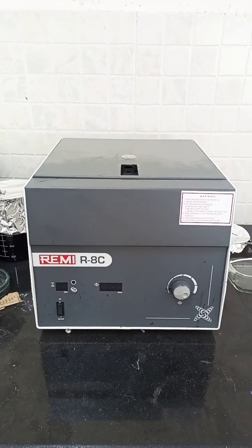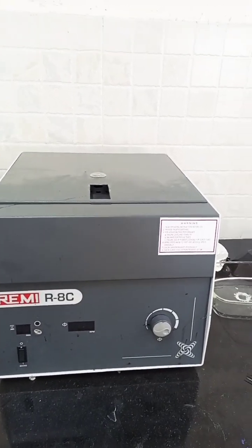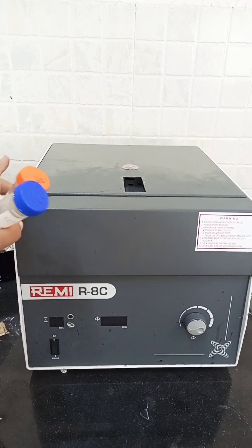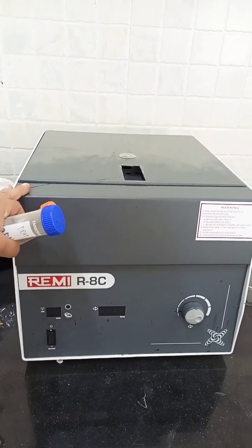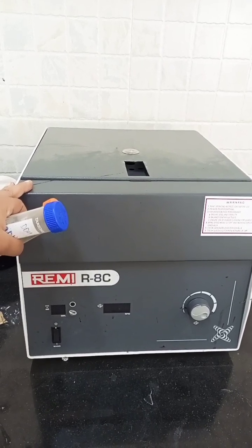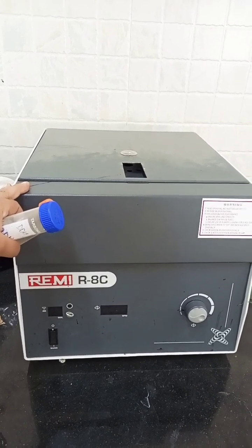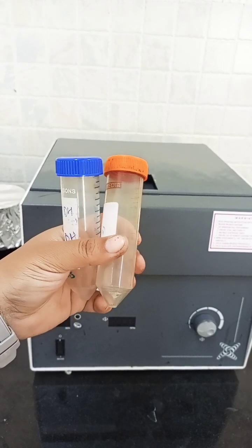Today we'll learn about the principle and working of the centrifuge machine. This is a kind of machine that works on centrifugal force, with the help of which it separates different materials from a solution — either solid from liquid, or oil from liquid. For example, cream in milk or solid particles in a liquid.